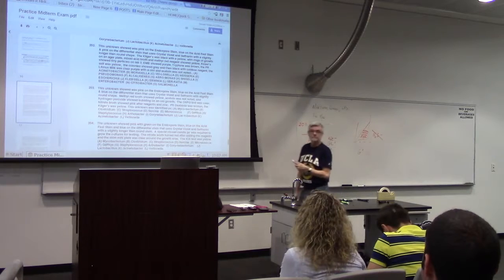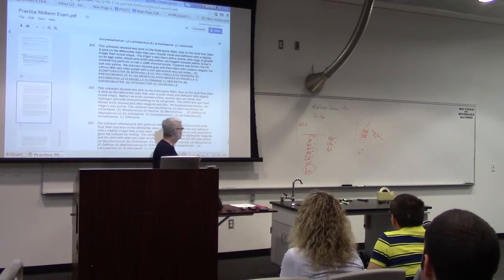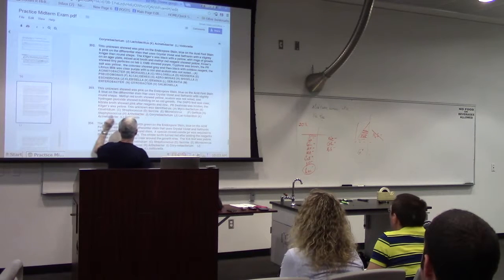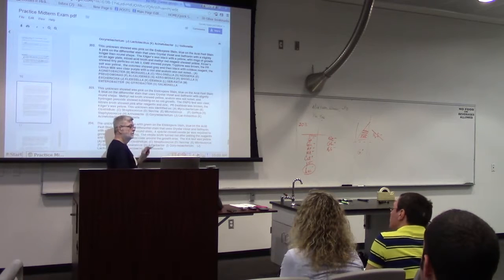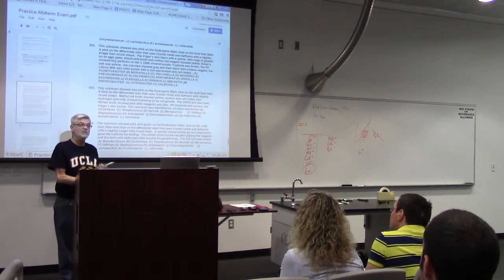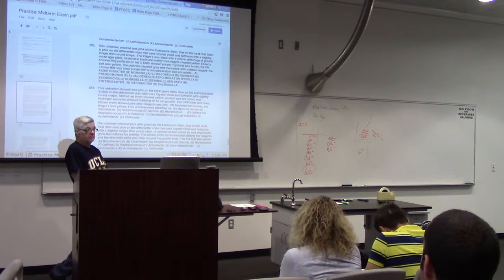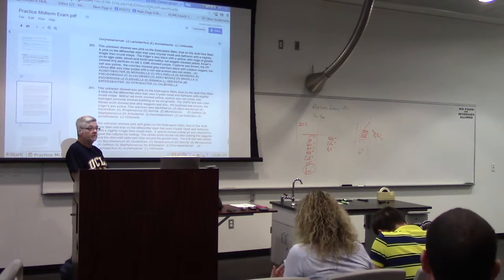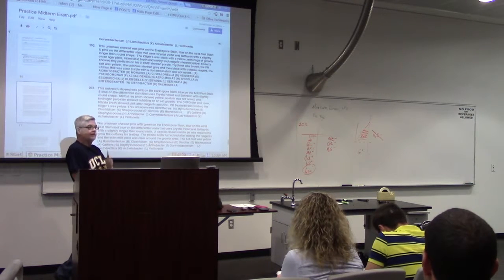So you wouldn't assume that the whole tube is yellow? Nope, just yellow. It didn't say where. I mean, if it said in the butt or if it said in the slant, that'd make it interesting. But it just says Kligler's was yellow. So you don't know where the yellow is. You just know there's not three colors. And you know that the lactose test, ONPG, is incredibly trustworthy.